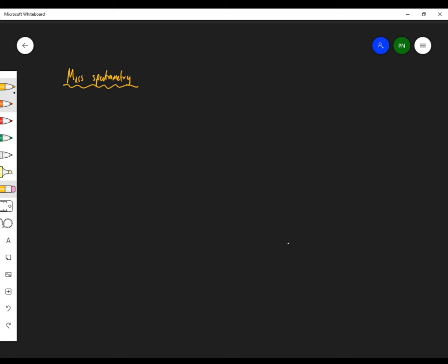All right, let's have a look at the machine itself. Let's have a look at a mass spectrometer. What does the machine look like? Now, I'm going to draw it very schematically. First of all, you have the vaporization chamber. You put your stuff in here and the stuff is vaporized. So the first thing that happens is vaporization. If it's a liquid or a solid, it gets vaporized.